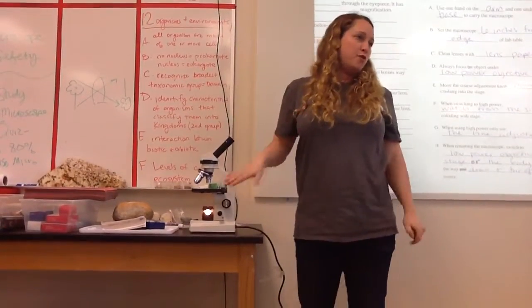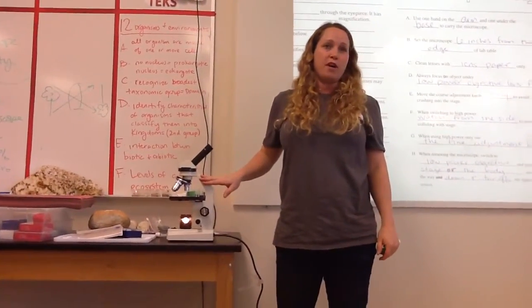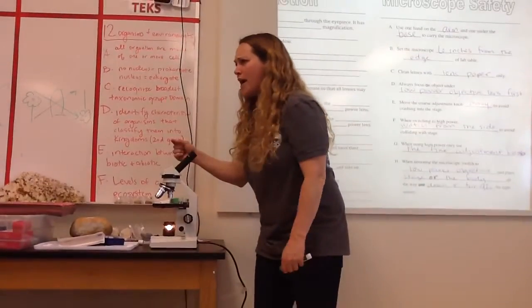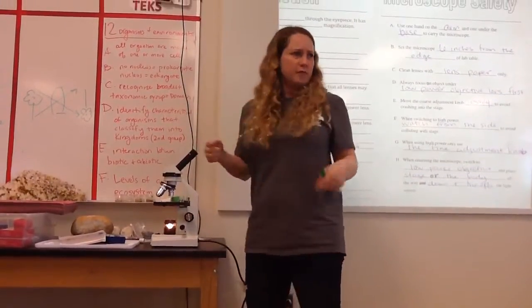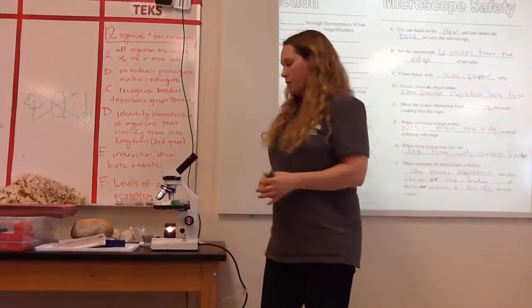And when you use the microscope, you'll see what I'm talking about. It's kind of weird. It'll trip you out. You'll be like, I wanted to go right, and when I push right, it goes left. So it's because it's a flipped image. Does that make sense? You're totally going to freak out about it when you use it.